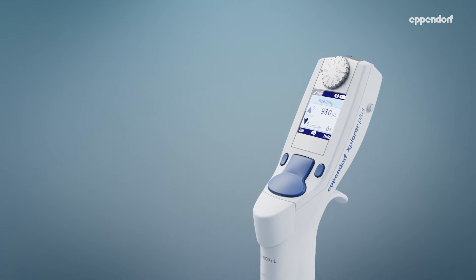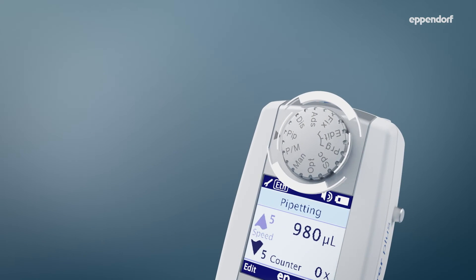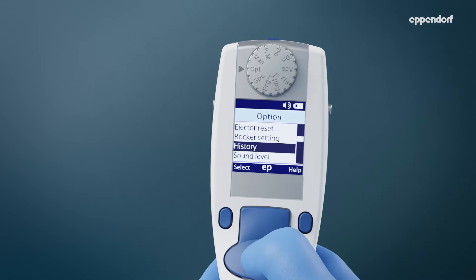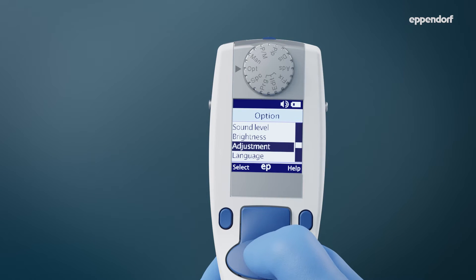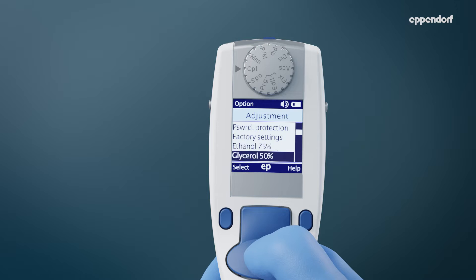To adapt your Explorer pipette to these situations, rotate the wheel to OPT for the options menu and use the rocker to scroll down to adjustment. Eppendorf Explorer pipettes come with both pre-programmed adjustments and allow for your own custom adjustments at 1, 2, or 3 points.